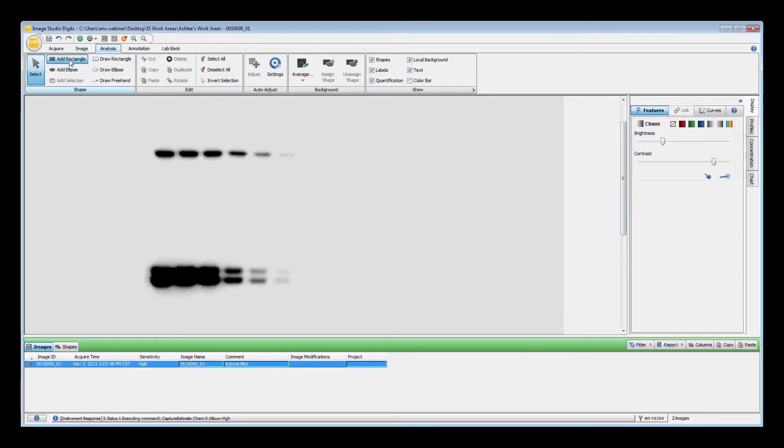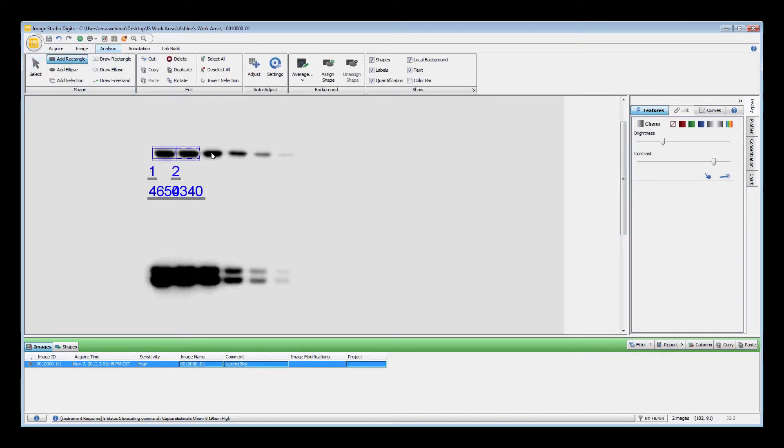Next, click in the center of a feature to place the shape around the signal of interest. The rectangle should be automatically sized to fit around your signal.